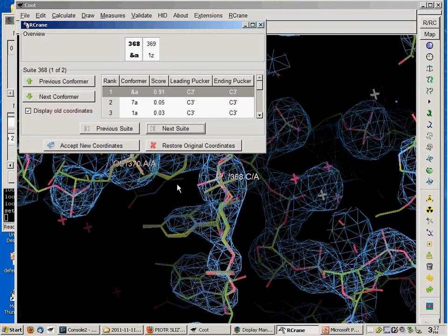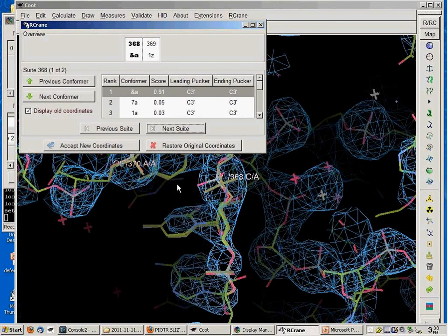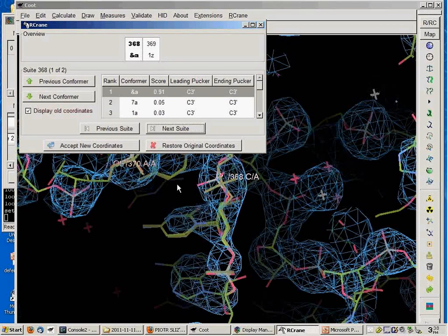You can also use it to search for motifs. There are certain signatures within the eta theta plot that you can use to find motifs. So there's a couple of features in there. Yes, it should be available on SBGrid. So I think if you just type in Amigos 2 from an SBGrid command line, you should get that up and running, and then you can load in crystal structures and do searches. Okay.